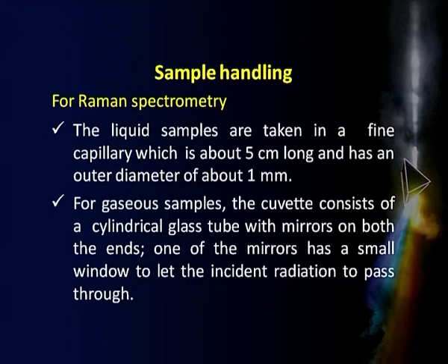That means the radiation will come in, pass through, get reflected and absorbed, and then what you see is the consequence of that in terms of the scattered radiation, which we try to measure.